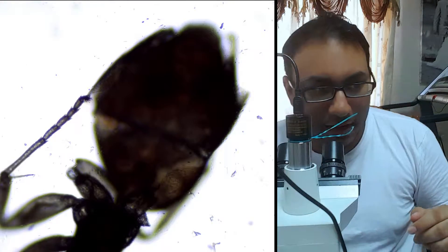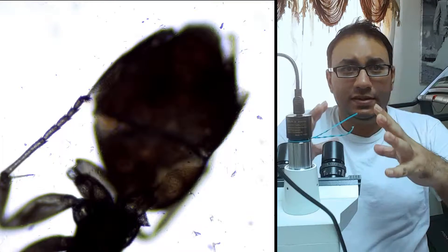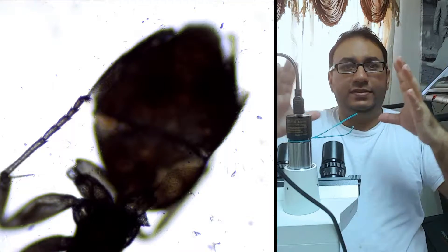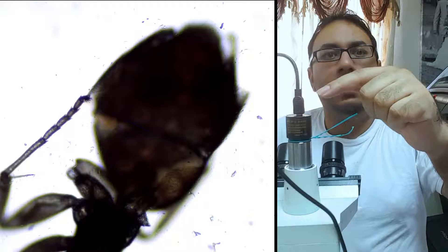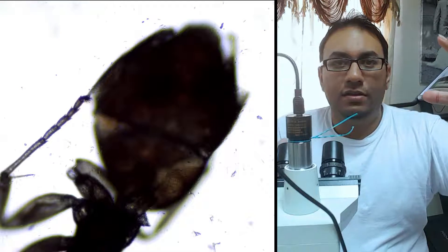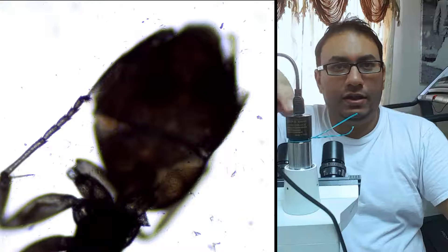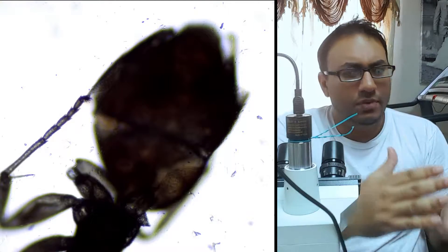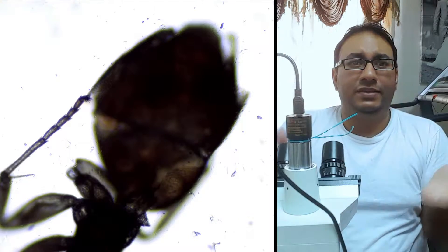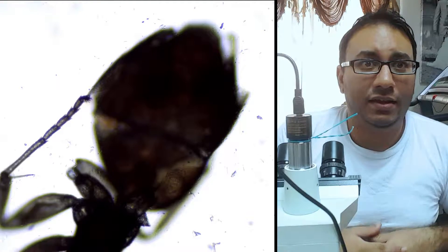Looking at it right now, what I see on the microscope is still the full image, but when you use the camera you only get to see partial. Right now the microscope is able to see the entire ant, but the camera is only able to see maybe about half of that. That's something I couldn't really resolve — I actually noticed this today.